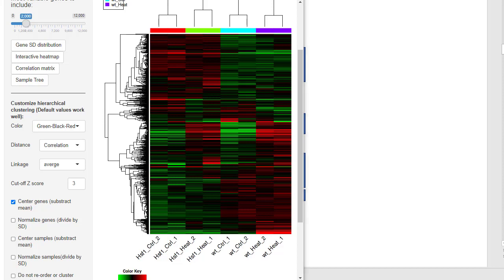The reason I spend so much time here is that I want to show you that even before you start differential gene expression, you should start to observe a lot of patterns and a lot of change. This is also a time where you can observe unexpected findings, and if anything is wrong with your experiment, you can start to see it, for example, replicates that are messed up and not grouped together.